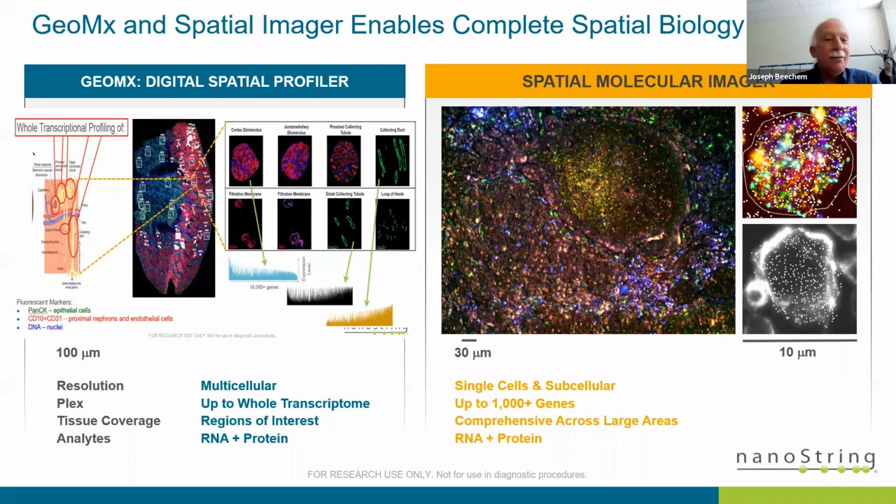Okay, this is my last slide. So hopefully, I gave a little vignette on the thought processes and what it's like to do high-plex protein profiling, whole transcriptome profiling on what I call functional units of tissues. I think it's really powerful. And the fact is that Mother Nature didn't make the important functional areas in an XY coordinate grid that we can manufacture. You have to actually adapt to Mother Nature's way of organizing its functioning.